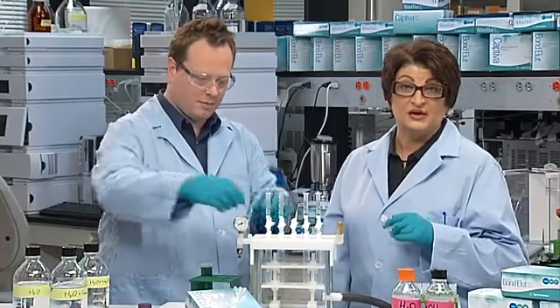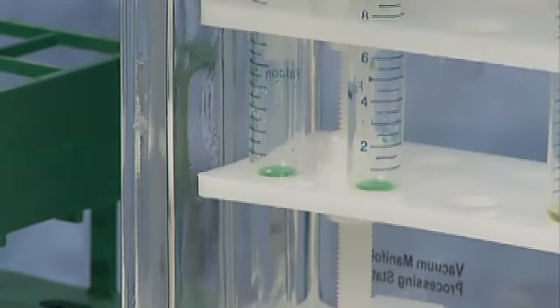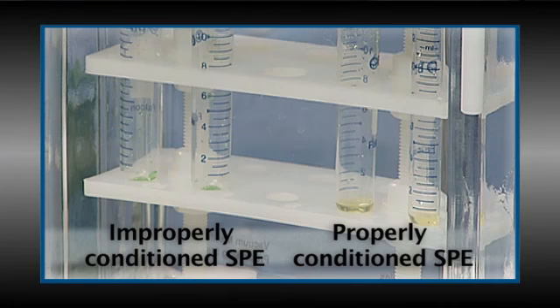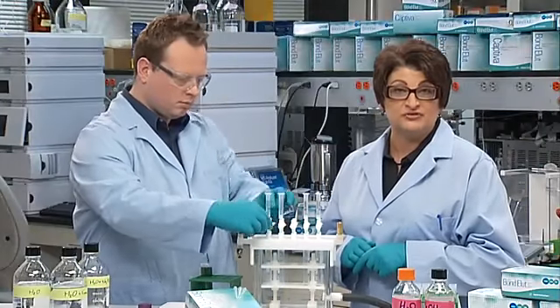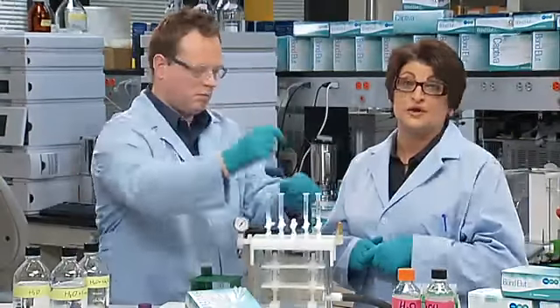As you can see, when we add the sample to a poorly conditioned SPE material, the sample is not retained as well as on the properly conditioned SPE material. The result will be breakthrough of your analytes of interest, which will lower recoveries and negatively affect RSDs, or relative standard deviation.